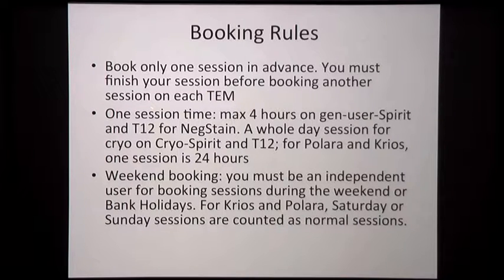And then how long the session is, we defined for the general use, and for the negative stain microscope, I think half a day is okay. 4 hours is quite long for people doing a good check of a lot of grids. But usually people don't need that long. 2 hours, 1 hour, even jump in half hours in between.